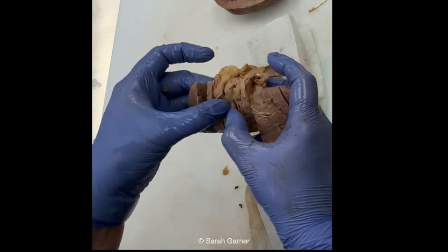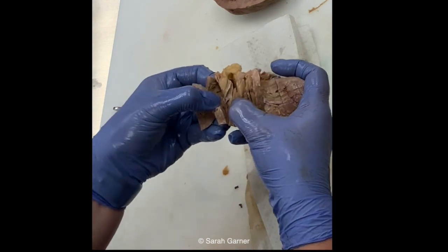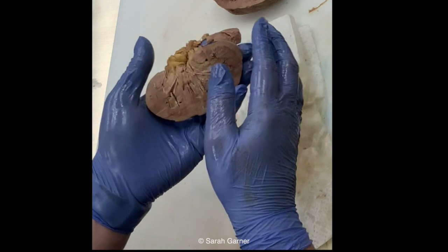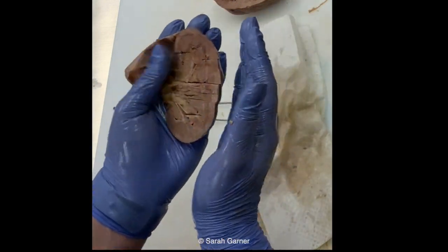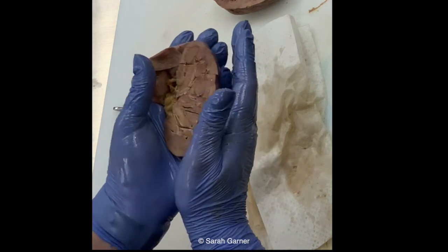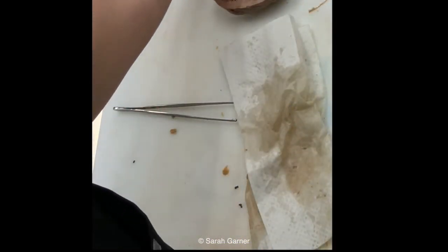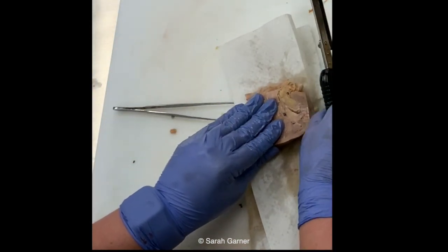So you can look at each surface. And if you see something abnormal and you need to finish that cut, you can always finish that cut. I just try to keep things intact, but also cut thoroughly. That way, if you're presenting the organs or if you need to take pictures or sections or whatever later, then you still have it intact. So once you've cut it, then you can sit it with your matching adrenal. And then you're gonna do the same thing with the other side.